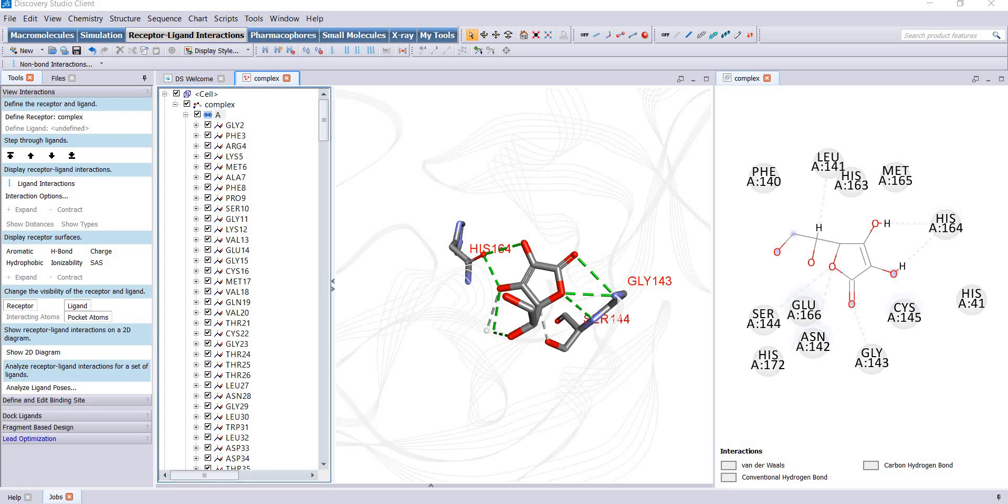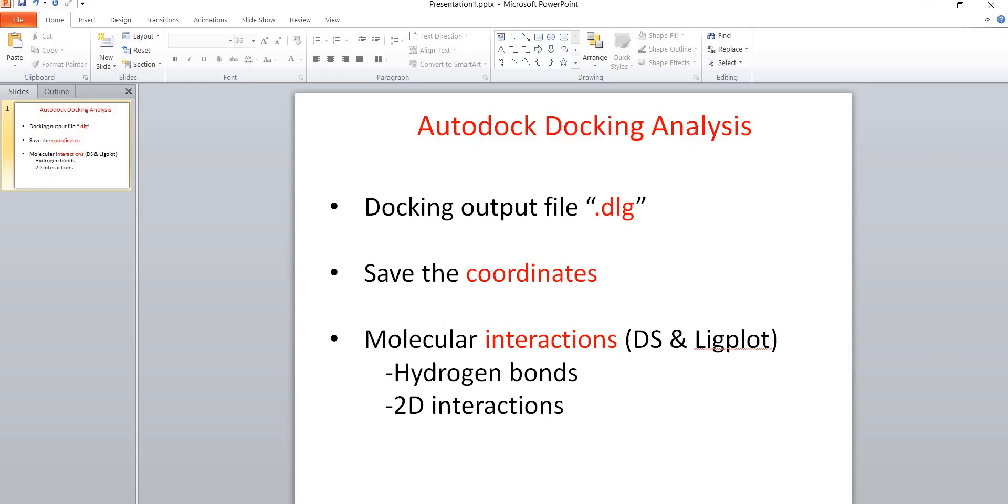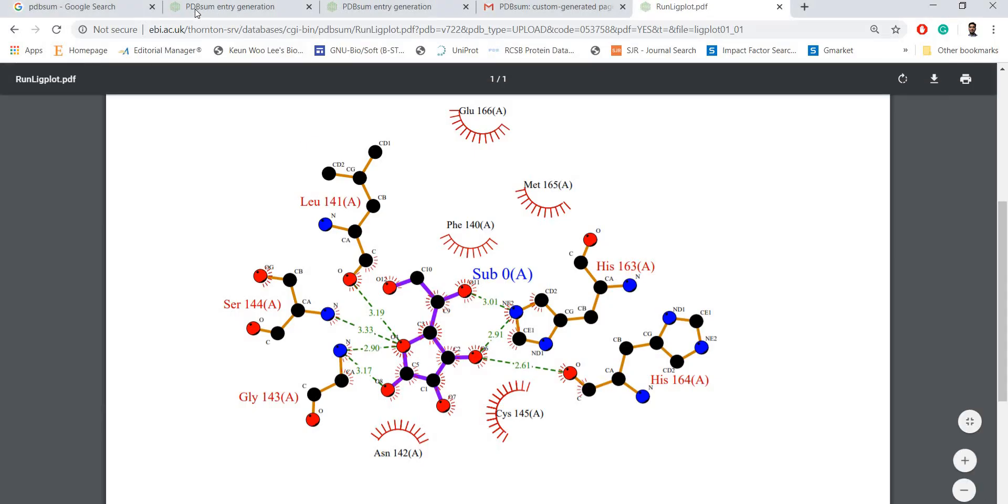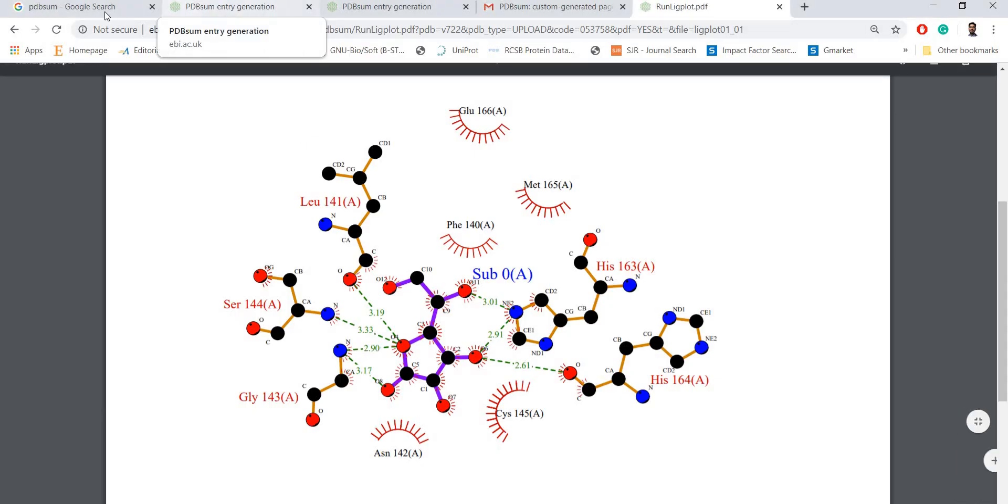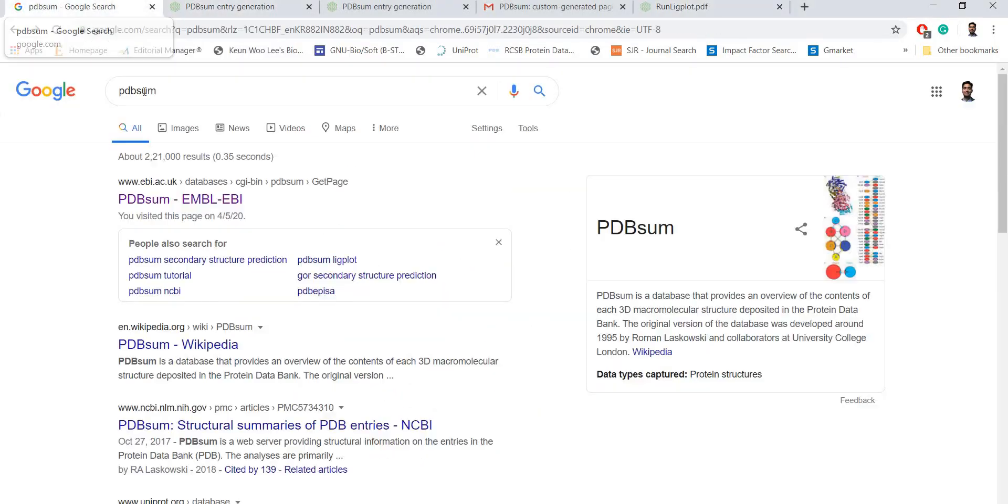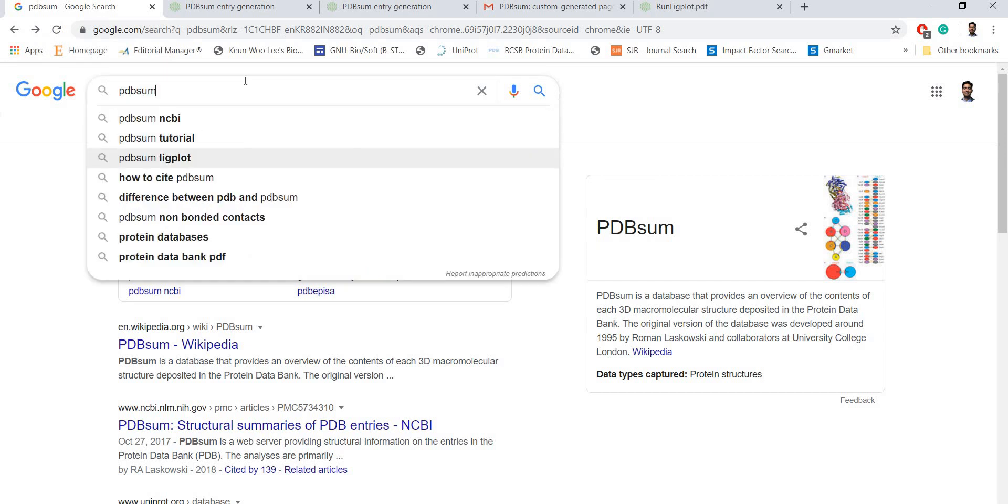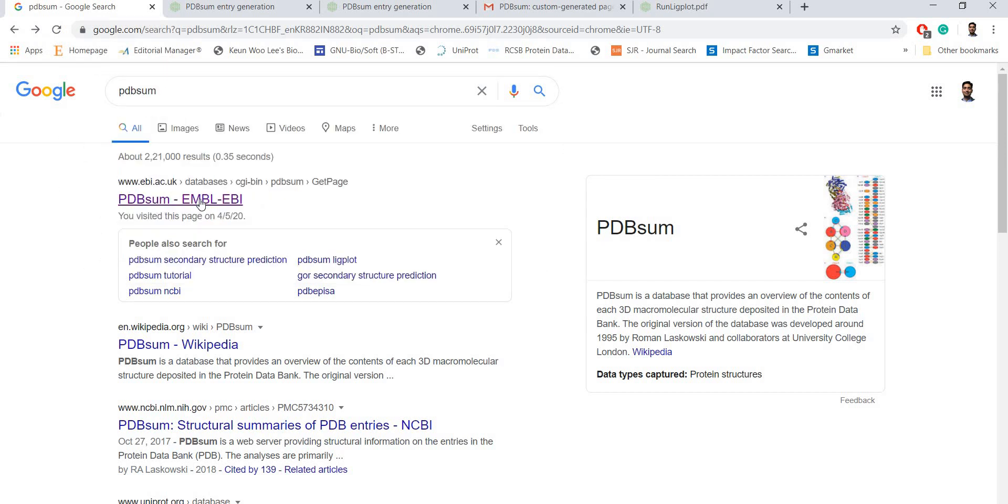Next is molecular interactions using LigPlot. We can use LigPlot by using PDBsum web server. Go to search, open PDBsum.